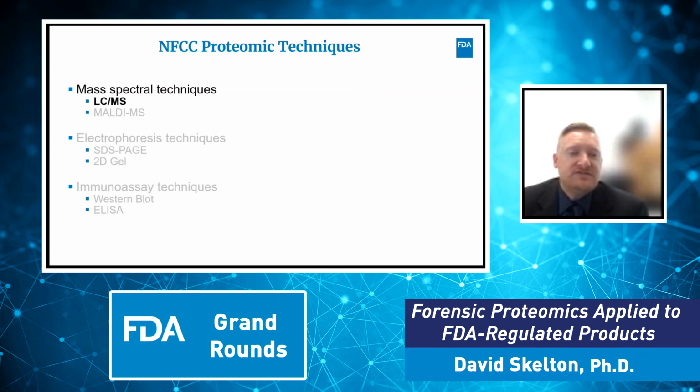For the purpose of today's talk, I will only be focusing on the work that I am involved in, which is the mass spectral techniques, primarily using LCMS.